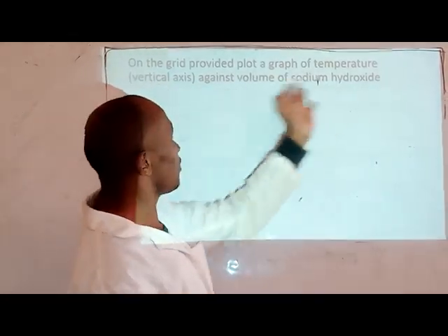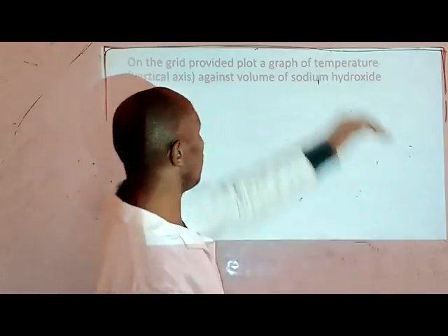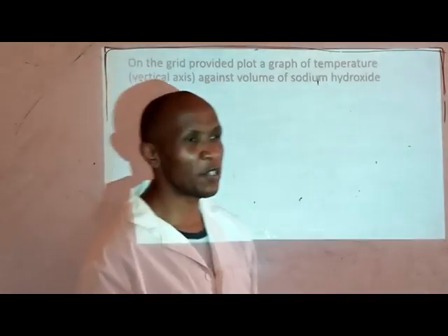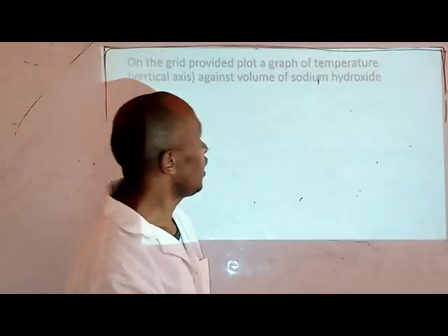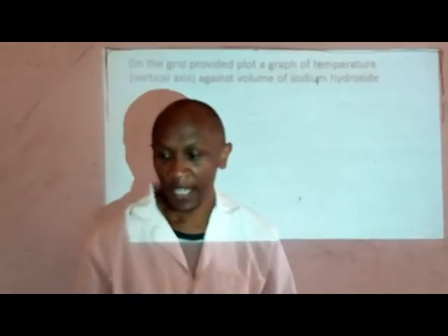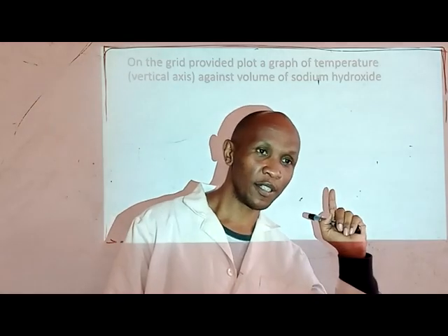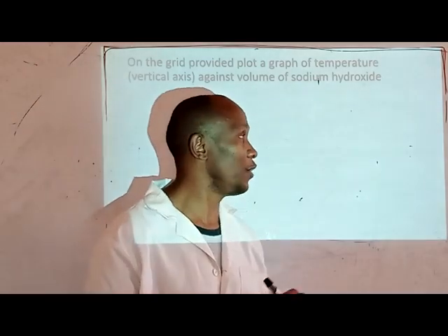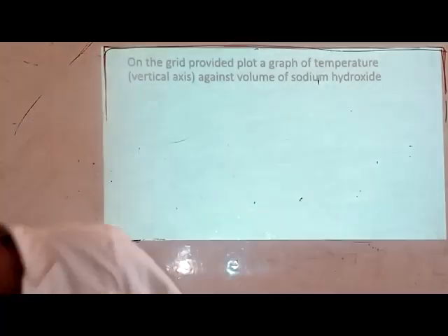I expect you also to take some time and plot a graph of temperature on the vertical axis against the volume of sodium hydroxide. Please do that, and let's meet after you have done that. Hope you've paused the video and proceeded to draw the graph.